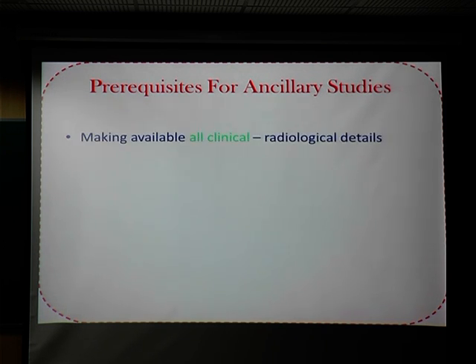Making available all clinical and radiological details. You should know everything about the patient before you are applying a technique which is higher than your routine preparations, like the routine H&E and Papanicolaou stains. You should make all the clinical details available. Have a good quantity and quality sample.